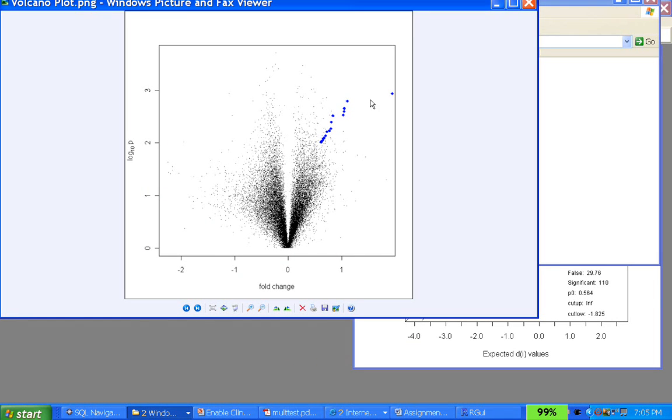So this is the volcano plot that should show up. I think what we had was about 20 features that showed up, and you're supposed to print it like that. When you take something on a minus log p scale, the low p-values become higher values, and that becomes the height here. So it makes sense, right? Because they were all overexpressed. There was no underexpression or negative fold change. There was all positive fold change between the two groups of GSM files that you analyzed.